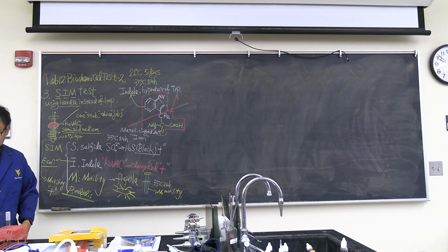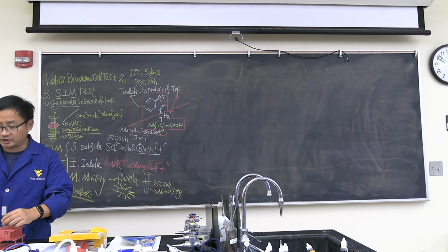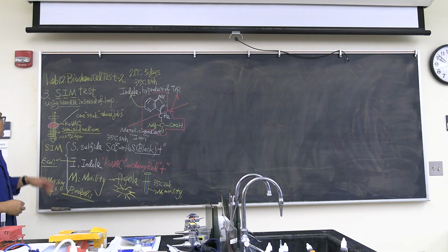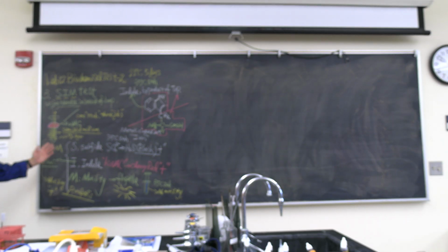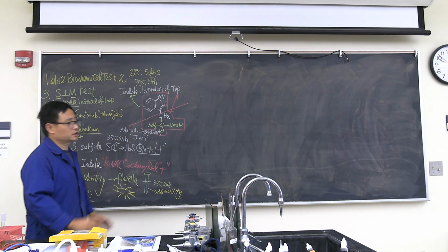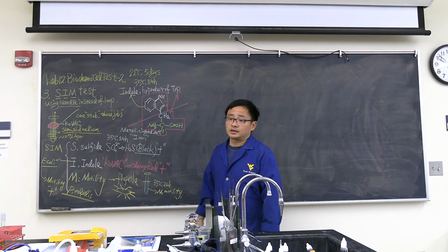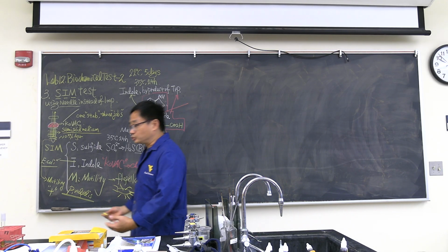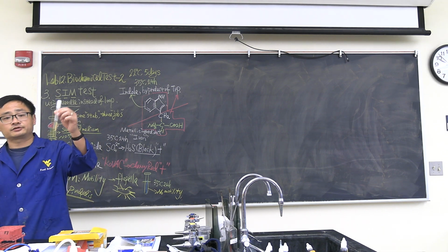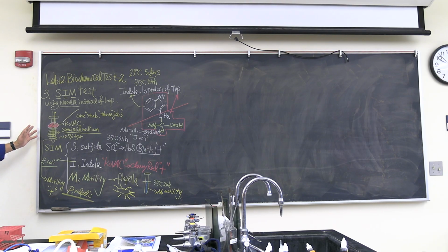Then we're going to add Kovac reagent on the top. I'll just do a demonstration for a couple of samples, not everybody, okay? If you see cherry red color comes out, it is positive. And I can tell you right now, E. coli is positive because I want everybody to know it's a very quick test for E. coli and very useful. And I also gave you an example. This work is simple. You can do it in 5 seconds. But the story is this long. So you need to know, okay?